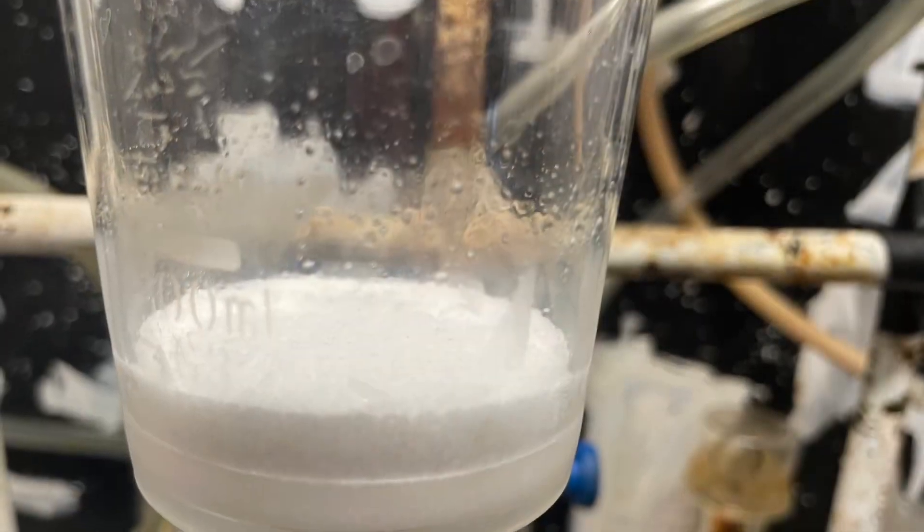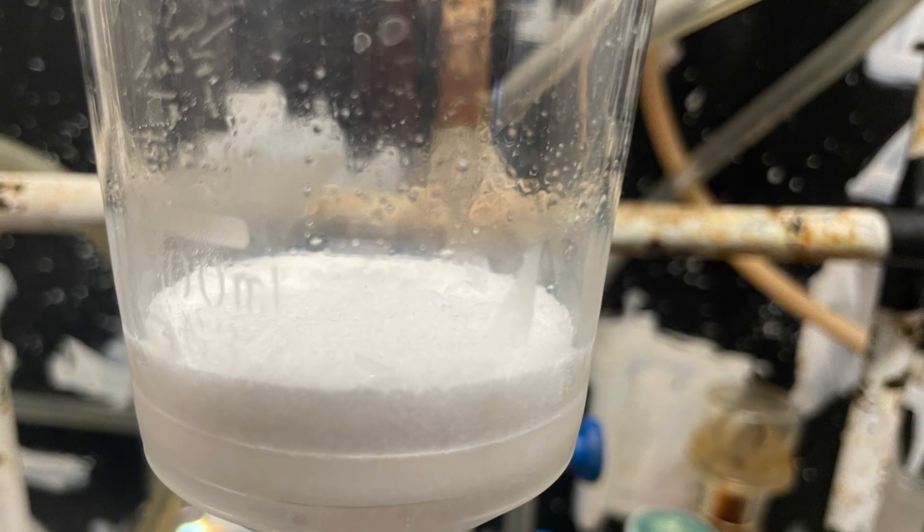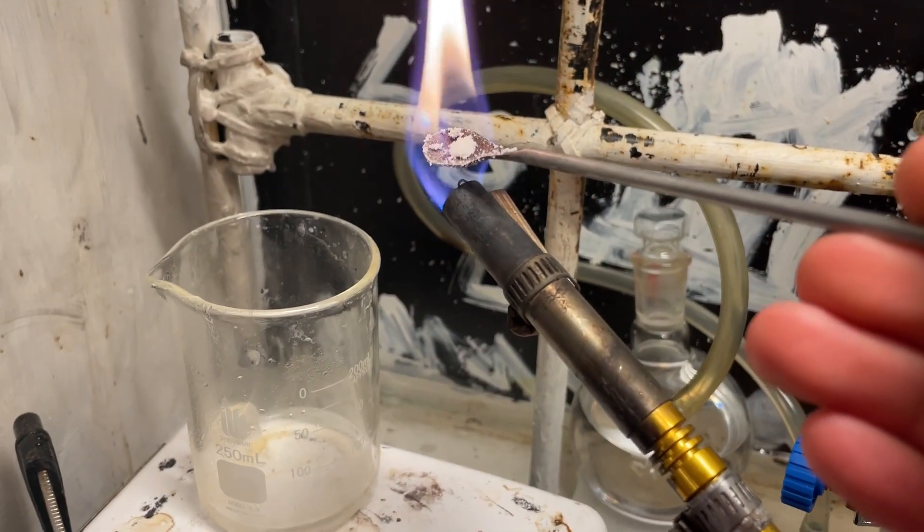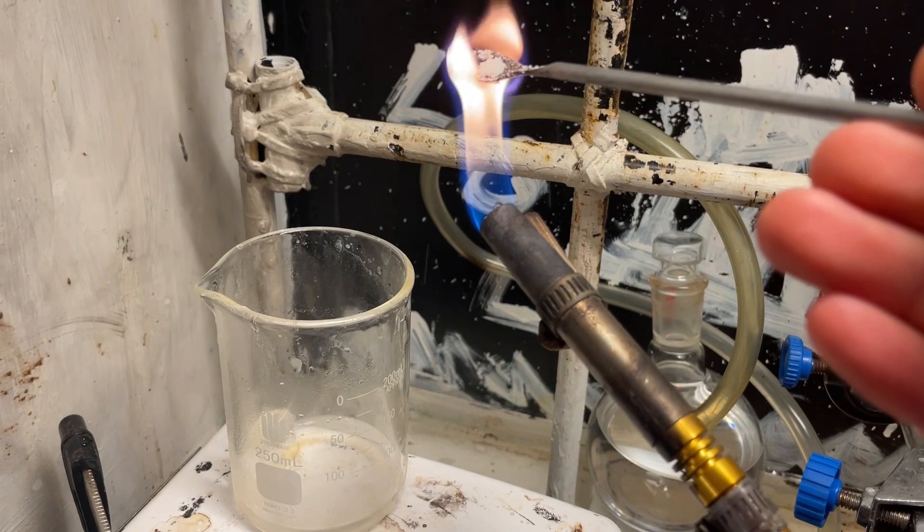Here's our final product — very simple synthesis, though it took a few hours. You can see it is indeed some sort of potassium salt in a flame; it makes that lilac flame. Really nice color.